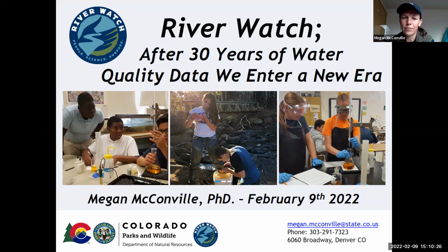But the title and the goal of this Zoominar is to describe a little bit of the black box of what happens when you collect your metals samples and then send them to us. How do we actually analyze them? So this will take us into the Fort Collins lab, and not specifically.